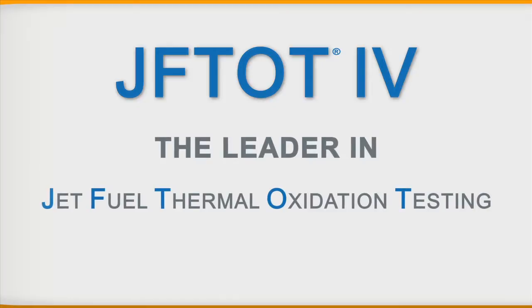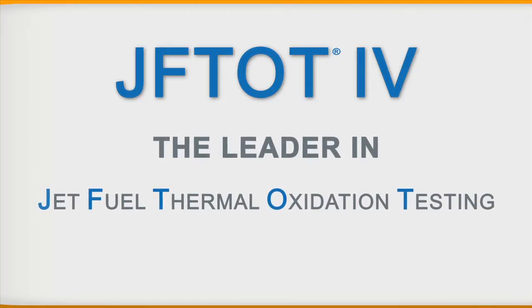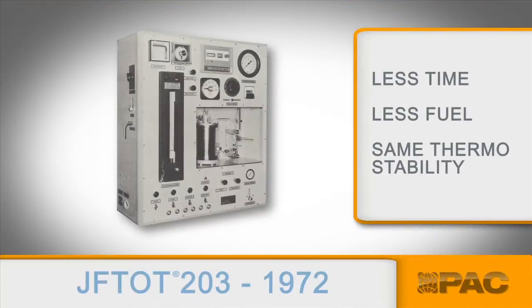P.A.C.'s Alcor Jet Fuel Thermal Oxidation Testing Instrument is the undisputed industry leader. Since 1972, we've manufactured the Jephtot Analyzer.